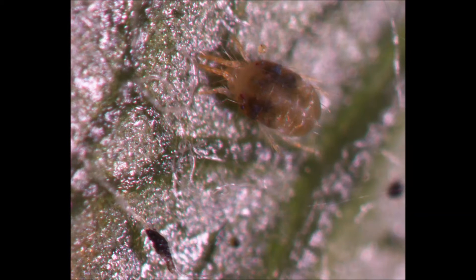As you watch the mite feed, you notice that her spots actually appear to shift. This is because these spots are actually digestive pigmentation within her body.